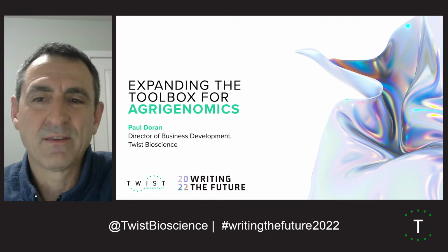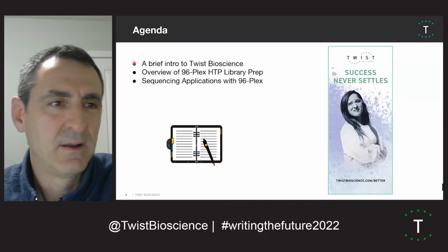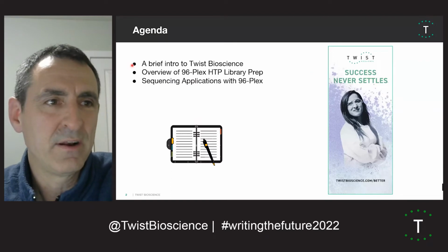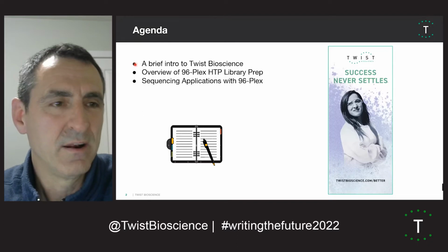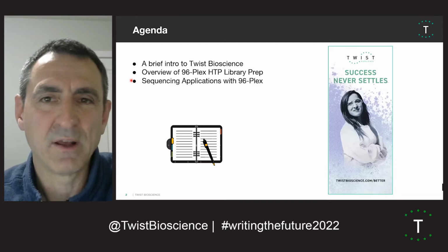The title of my talk is Expanding the Toolbox for Agrigenomics. For the agenda, I'll give a brief intro to Twist Bioscience, then an overview of the 96-plex high-throughput library prep, and then go over some sequencing applications with the 96-plex.